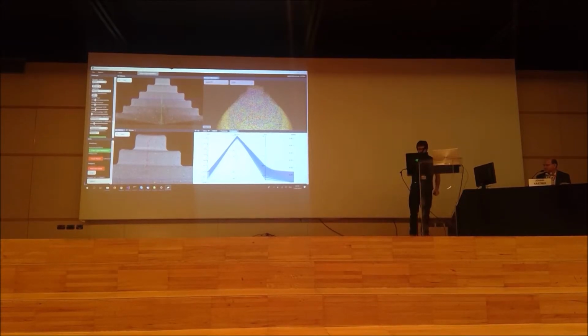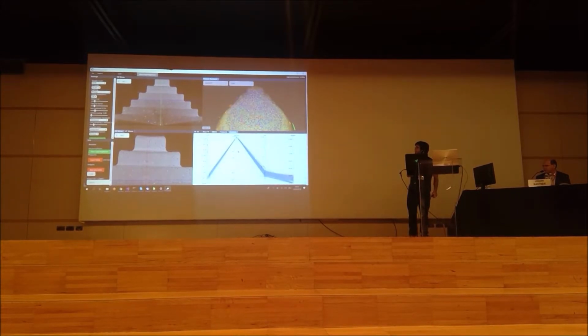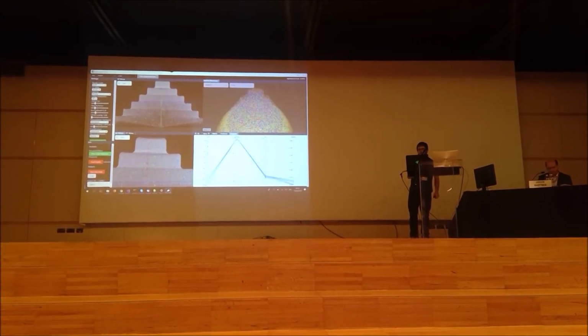For example, here we have some unwanted artifacts, like such wrong detections, and we can, for example, filter them out by using the sphericity if we are looking for features which look like pores. Right? Now we remove them, and now we are in a state that we have a rather okay segmentation.